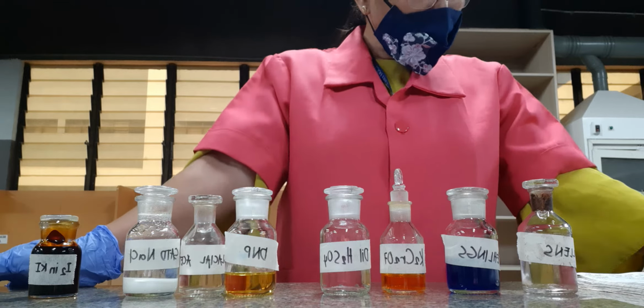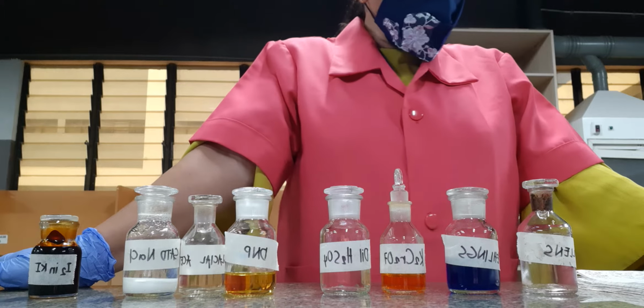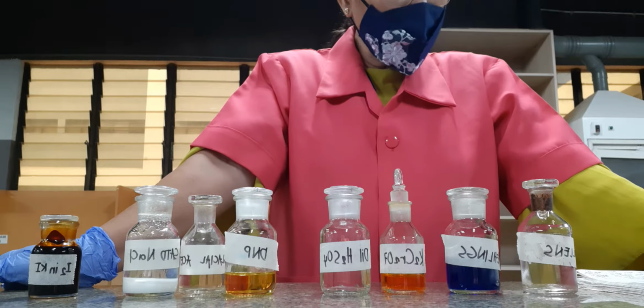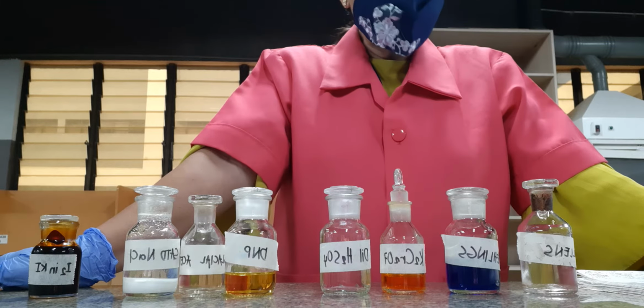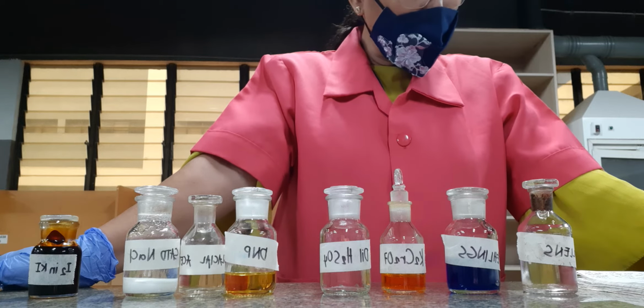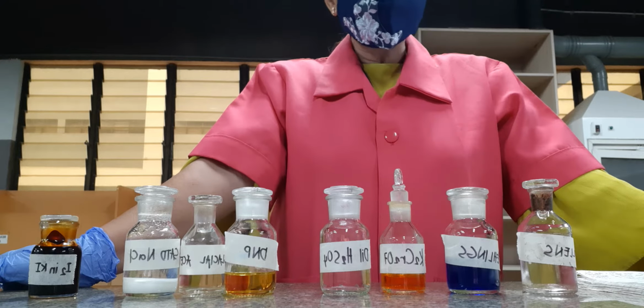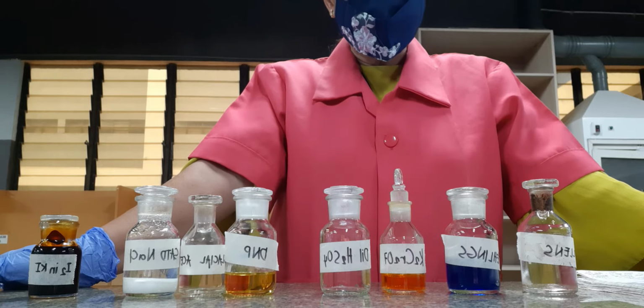Now our last test is what we call iodoform. By the way, what is an indication of using Brady's test or the dinitrophenylhydrazine test? These are mostly positive to aldehydes and ketones. Therefore, we expect a chemical reaction to take place between DNP and aldehydes as well as ketones.